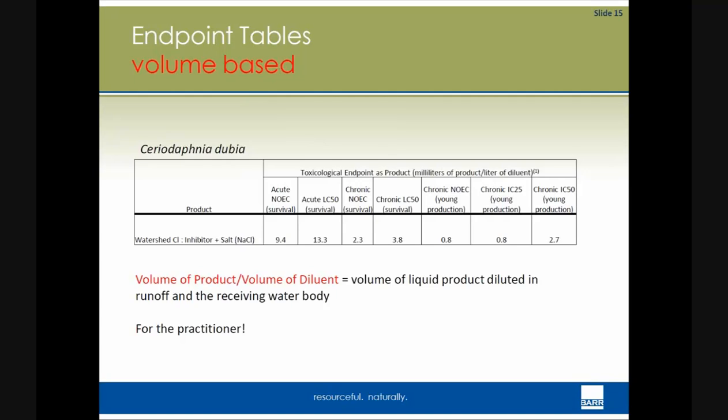So the temperature difference, I'm kind of punting, is not known. It may be that these chemicals might be more toxic at low temperatures or less toxic. I just don't know until we do the tests. To do the tests at lower temperatures can be tricky for cultured species in the lab. You can test Ceriodaphnia dubia at lower temperatures, but it doesn't do quite as well. Same with fathead minnows. So there's another layer of experimental work that will be required to figure out that question.